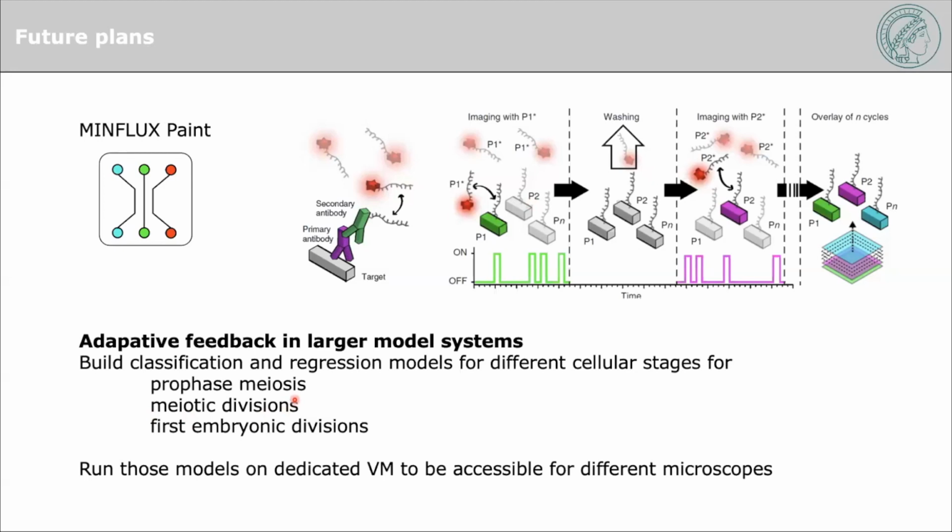Maybe some high temporal resolution images to look at how the nuclei are moving during this kind of growth of oocytes, and also do some photoactivation or cutting experiments.